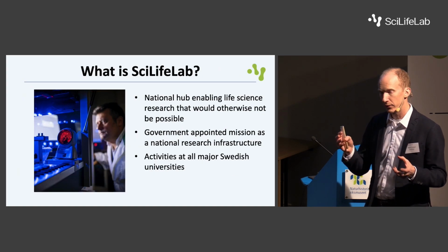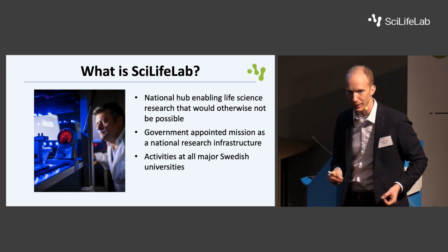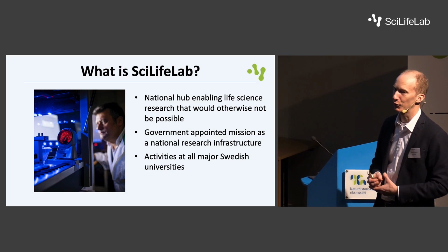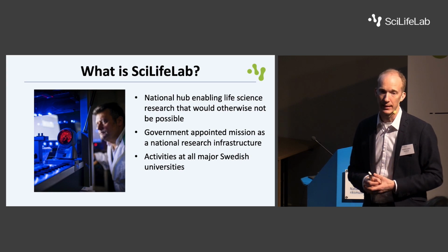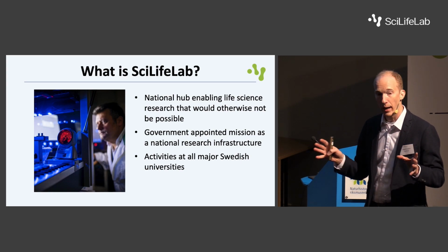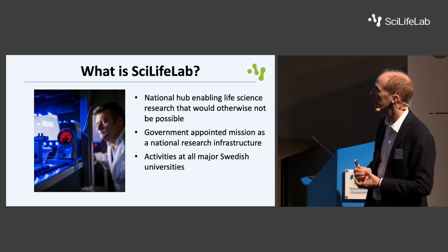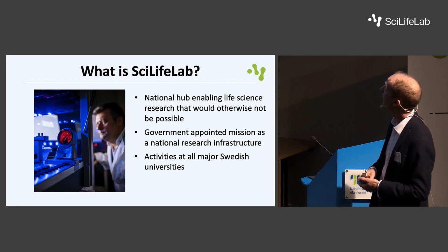But then, of course, all these 3 infrastructures are part of SciLifeLab. You see our poster of science here everywhere. Many of you are sort of aware of it, using it, but what is actually SciLifeLab? It's a direct government initiative to support life sciences. It has a wide range of different types of units and services. I think more than 40 units currently, 3 of which I mentioned in the last slide.